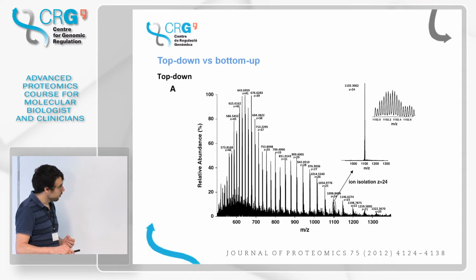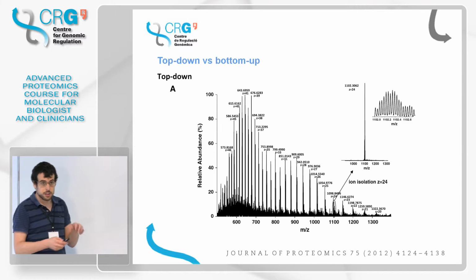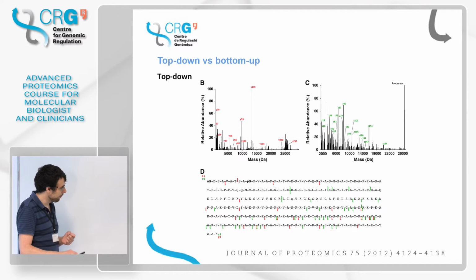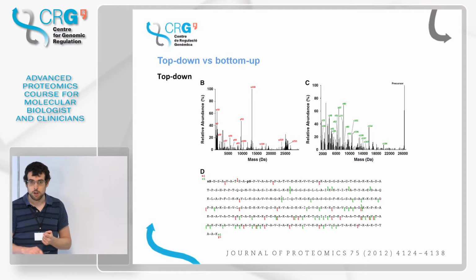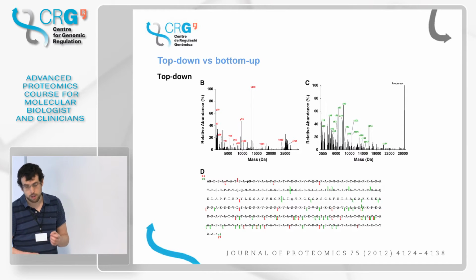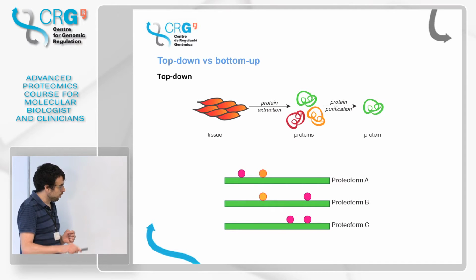Anyway, also what one can do is take, for example, this charge state, which is the most abundant. Using a quadrupole, we can isolate this charge state, so we can filter, so we get rid of this, and then we can fragment this and analyze the fragments of this protein. And having done this, these are fragmentation patterns of this protein for a particular charge state, and then we can get information about the sequence of this protein, and also information about potential modifications of this protein.